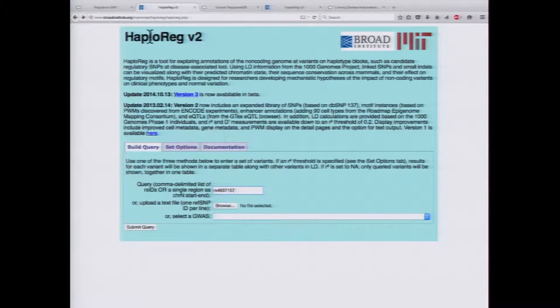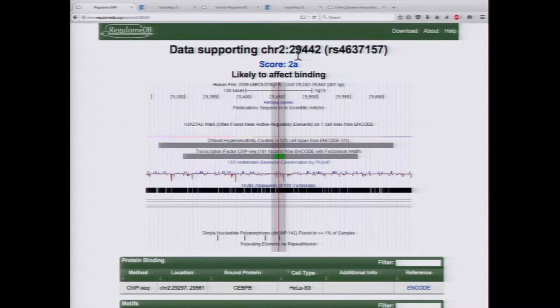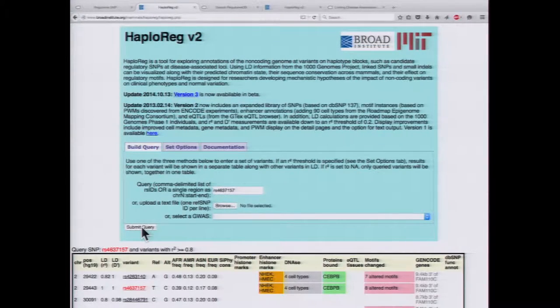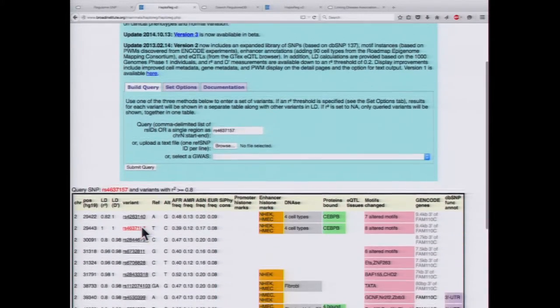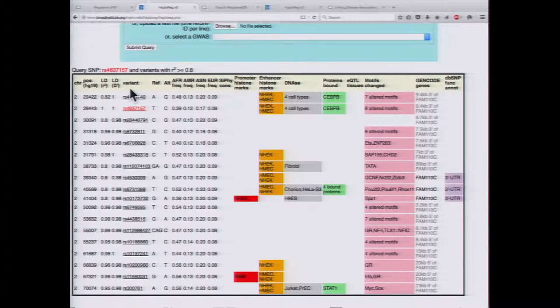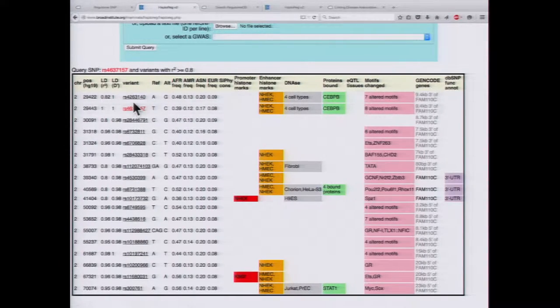We're going to enter the same SNP that we just looked at in RegulumDB. If you notice, we entered a query for a single SNP, but we actually get an entire list. This is because HaploReg returns all other SNPs that are in LD with your queried SNP. Our queried SNP is shown in red, but we also have all other SNPs that have at least an R-squared value of 0.8 reported.